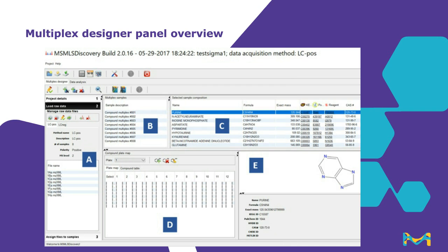And then after that, let's see, is the button to show library merging panel. And this is where we can merge libraries. And again, I'll describe that a little bit more in detail.